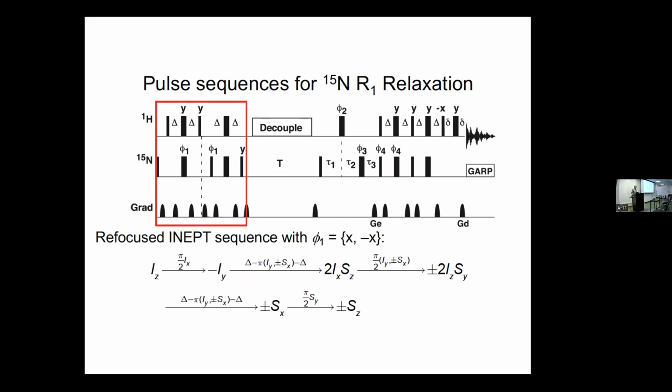But we also saw in those lectures that if we repeatedly invert one of the spins, we also quench the cross relaxation and get mono-exponential decays. And in the literature, historically, this was done both ways. So to saturate, you could just turn on a decoupling sequence like WALTZ and saturate the magnetization.